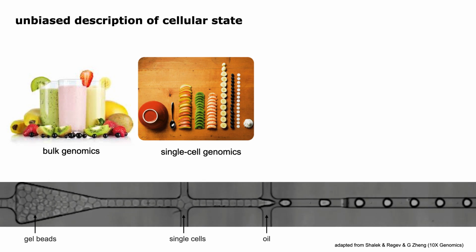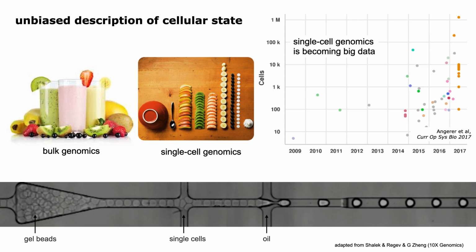We use this pipeline called droplet sequencing, and this is depicted here in this video, where you shoot the single cells into nanoliter droplets, and each of these droplets is a small reaction volume. This technology helps us to upscale the whole process of single-cell RNA sequencing to thousands of cells. And at the same time, it reduces the costs tremendously.